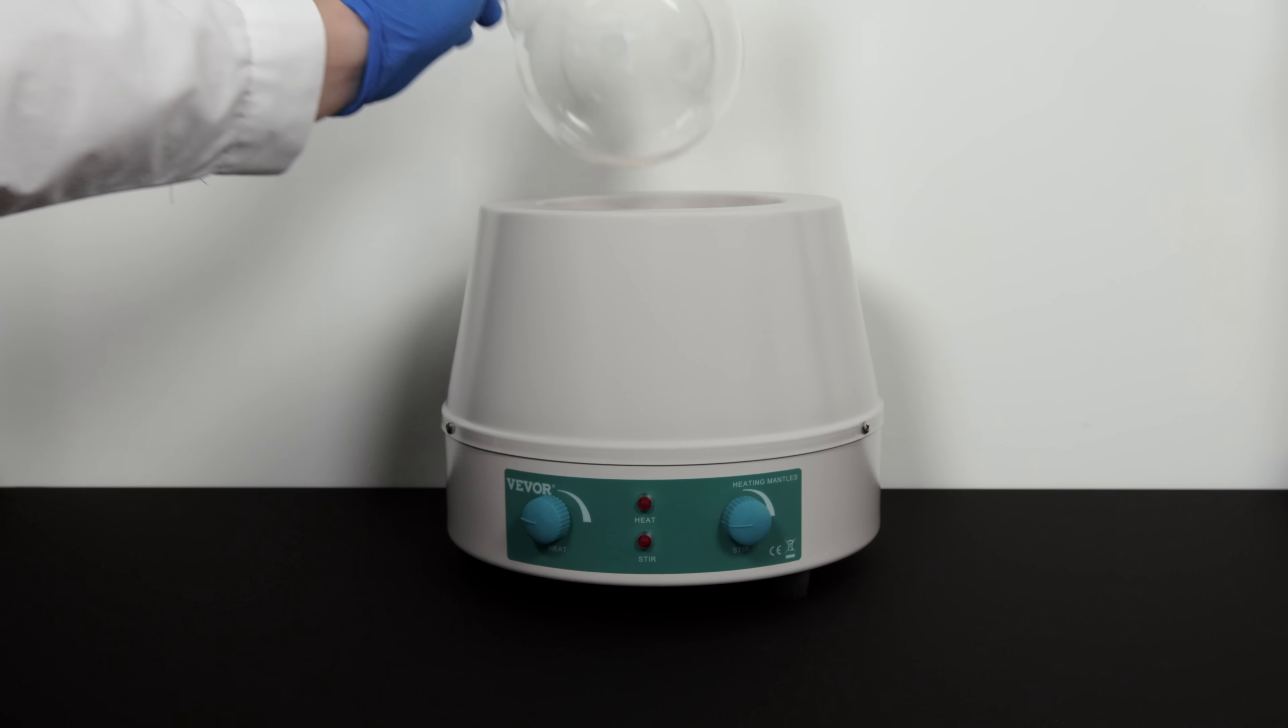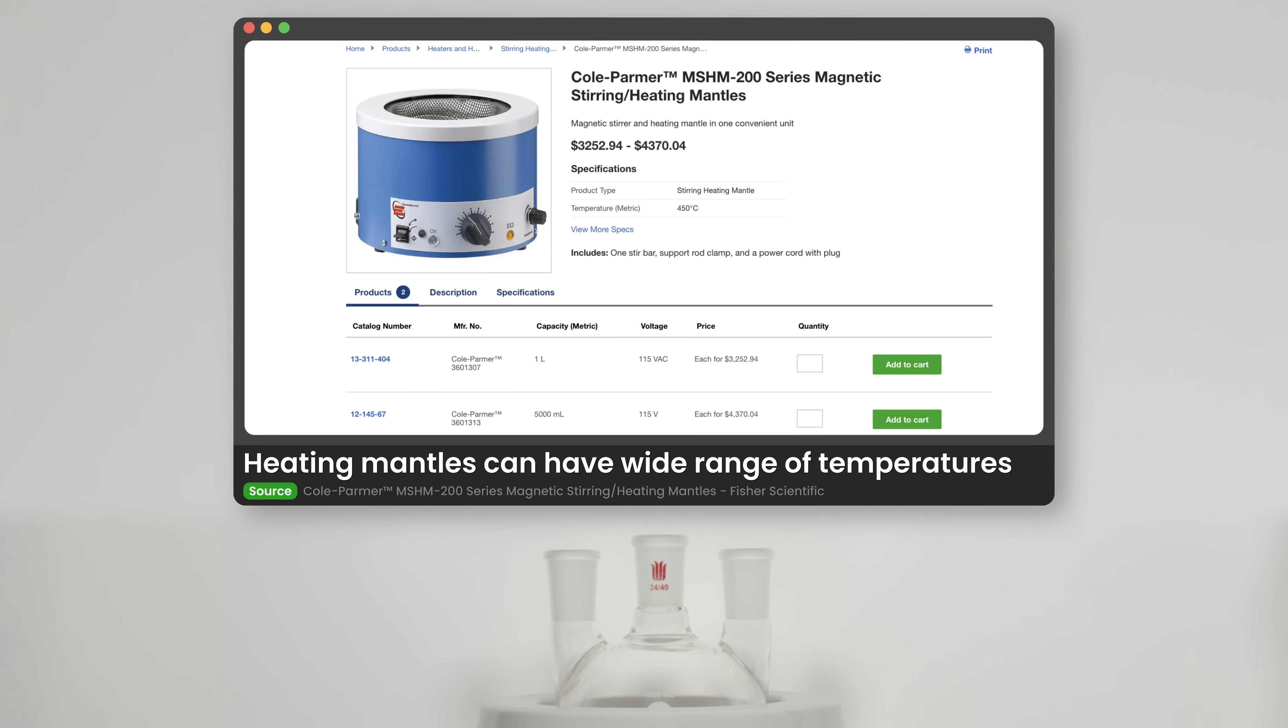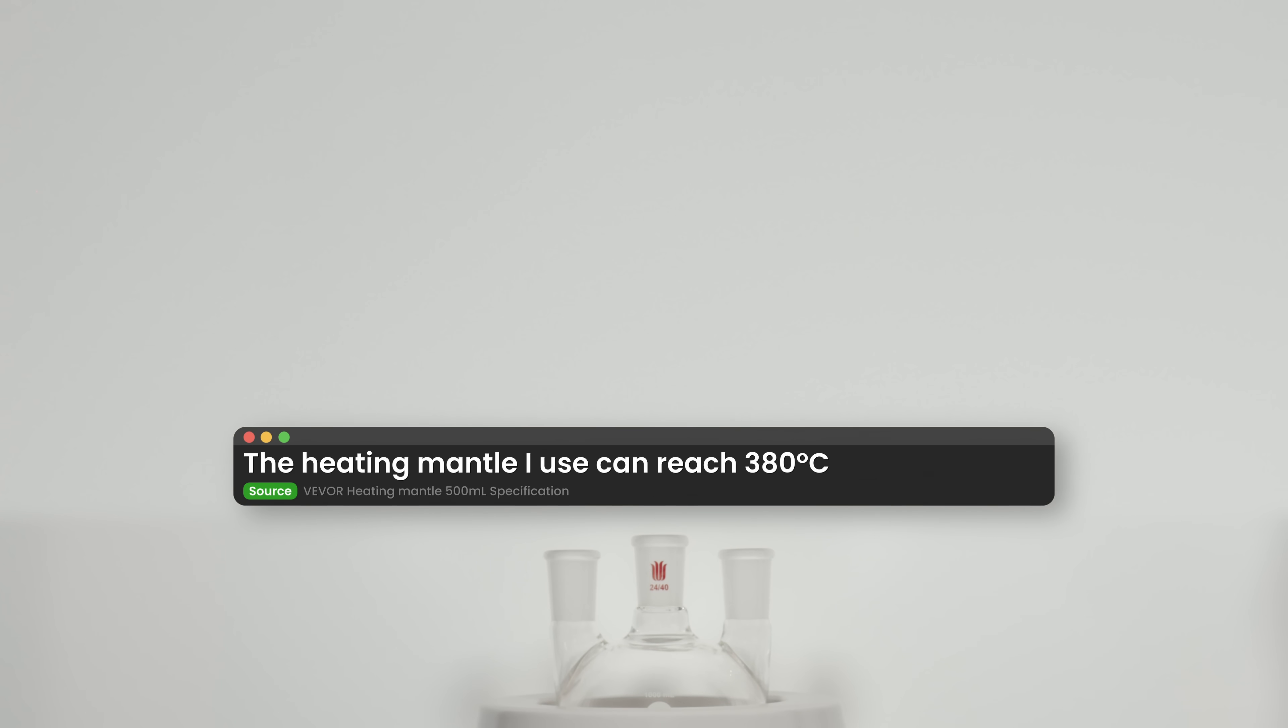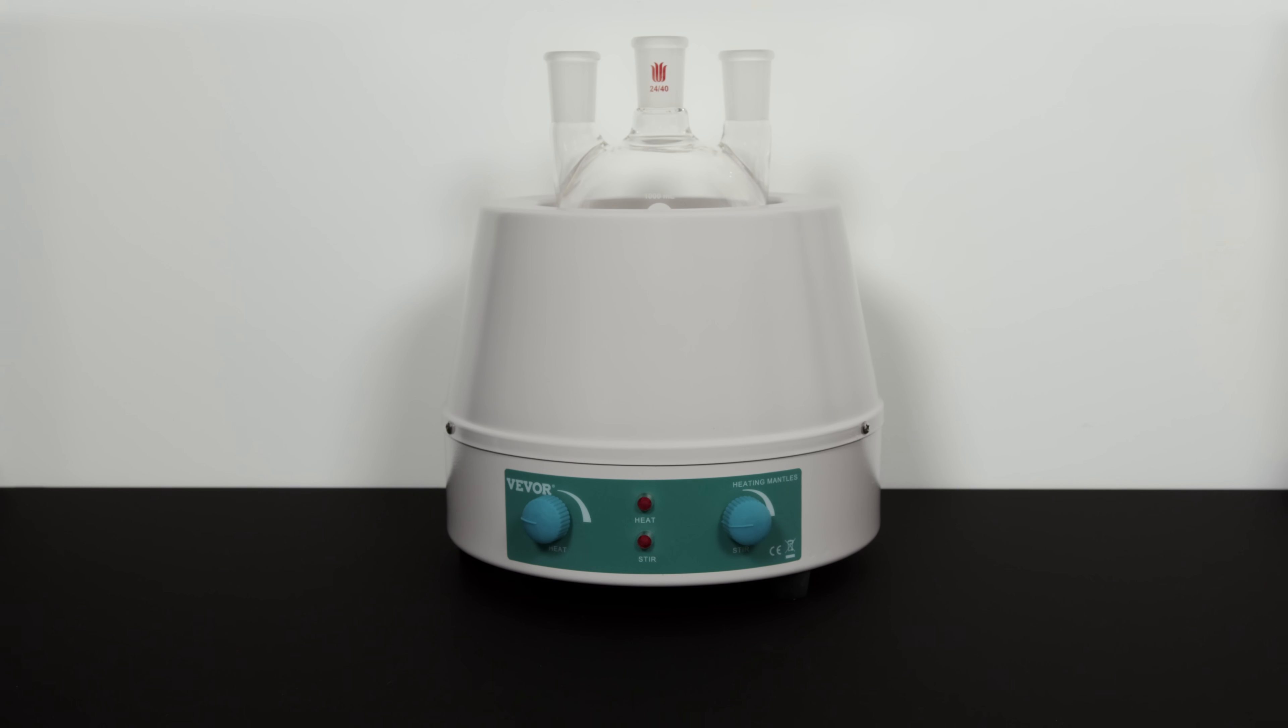My preferred option is the heating mantle. But I must warn you that most heating mantles may struggle to reach the required temperature. Some are limited to 300 degrees Celsius, while some can reach 450, and mine can reach 380, which is just enough to boil 98% sulfuric acid. There are side advantages of using a heating mantle. As it will provide an additional cushioning effect should a bumping occur, lowering the impact. And can also act as a safety net should a leakage occur, giving you more time to escape the scene.